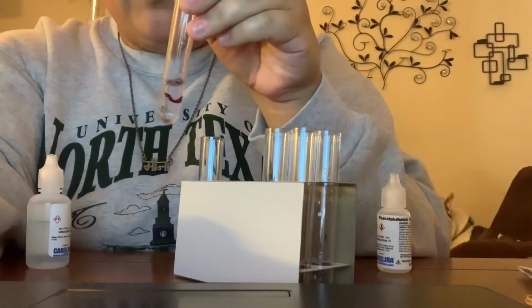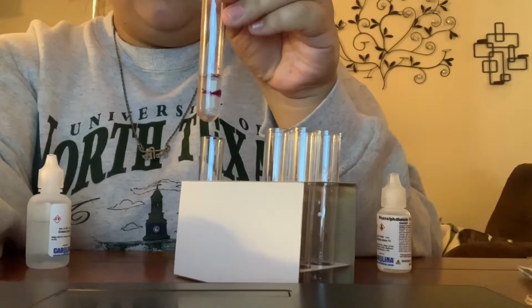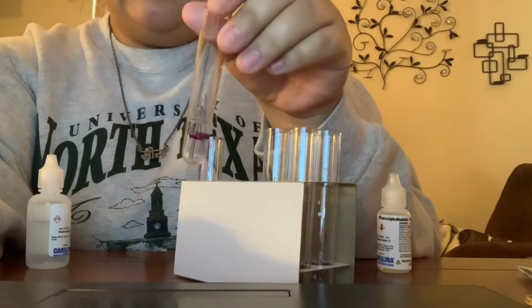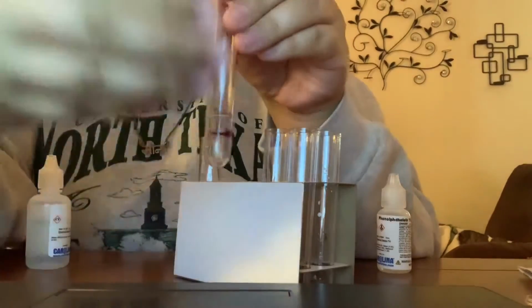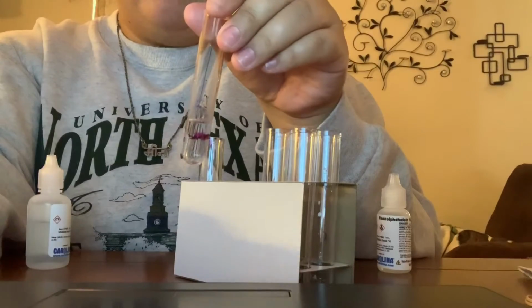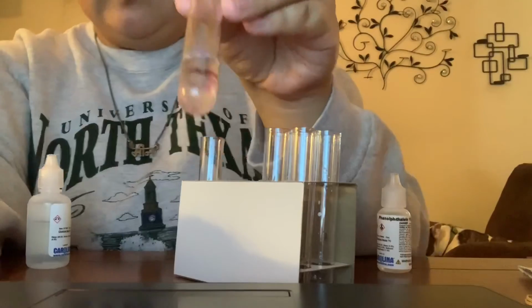I forgot to press record, but I put 1 drop of the phenolphthalein solution, and this is the pink blob I have going on in the middle. Before putting the drop in, I put the 2 milliliters of sodium hydroxide, and I recorded the temperature, and I recorded the color, and I put it all in the appropriate data table. But this is my floaty thing.